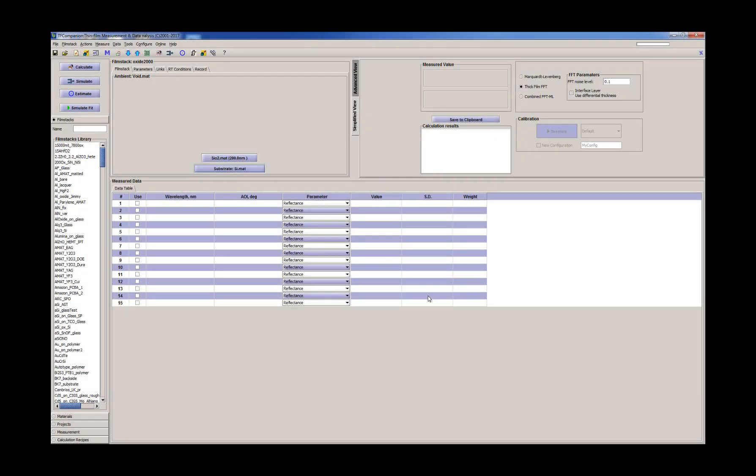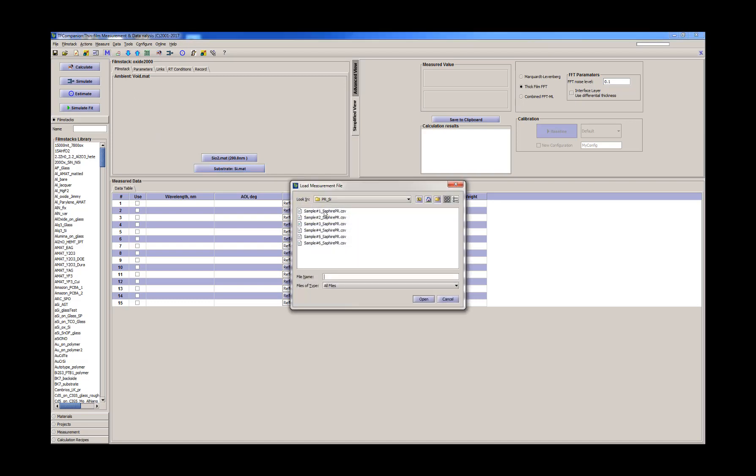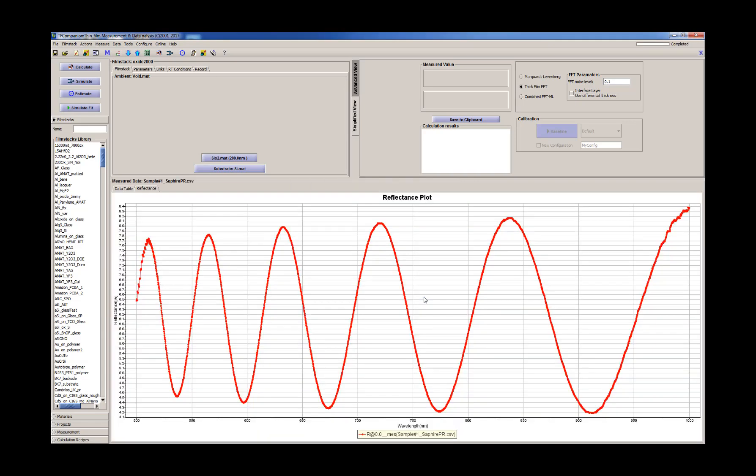Hello and welcome to the tutorial. In this tutorial we will review the building of the film stack for analyzing measurement data. The measurement data is photoresist on sapphire, so here is our measurement data.